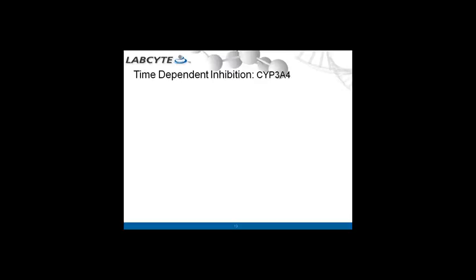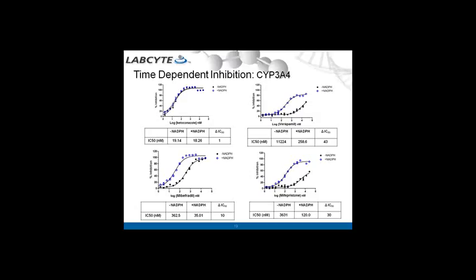So in this slide, I wanted to show the CYP450 result from the miniaturized time-dependent inhibition assay. Ketoconazole, a known CYP450 inhibitor, shows a very potent IC50, but no change in IC50 during the 30-minute pre-incubation. As expected, ketoconazole shows no time-dependent inhibition, whereas verapamil, mibefradil, and mifepristone show greater than 10-fold shift in IC50 during pre-incubation. These 3 compounds show time-dependent inhibition against CYP3A4.